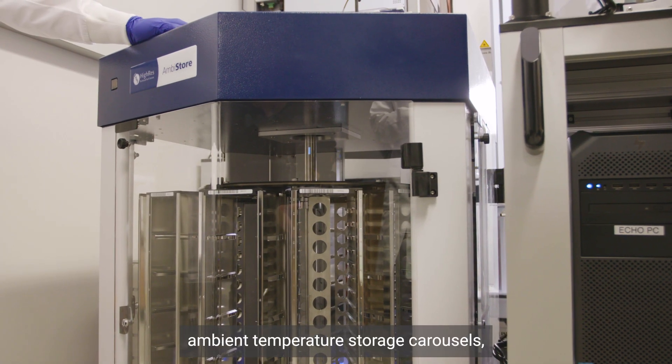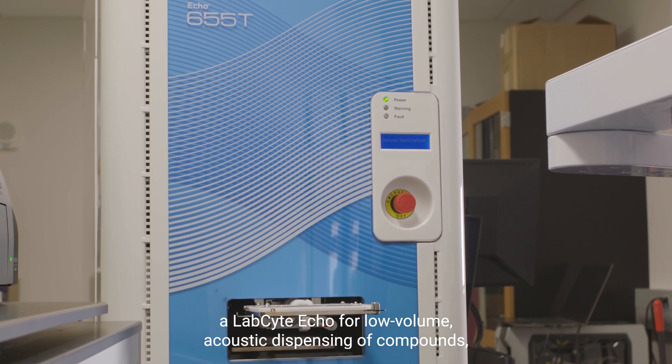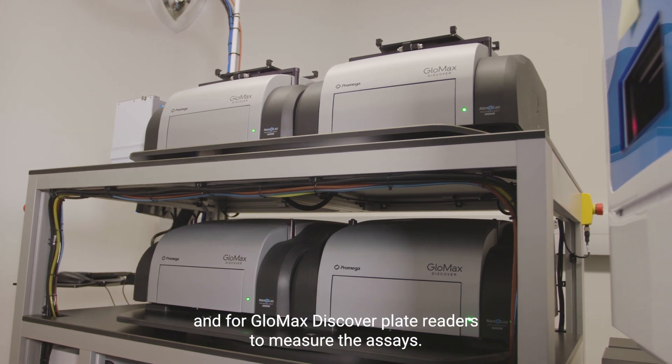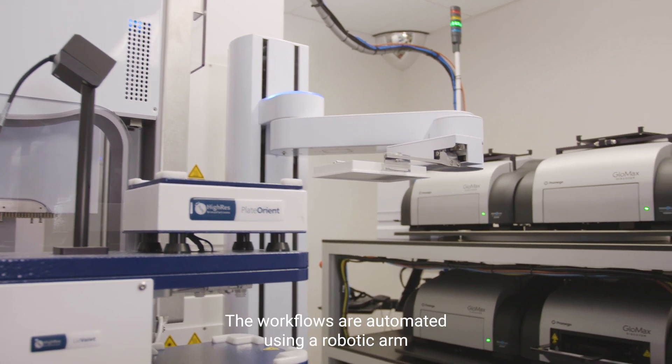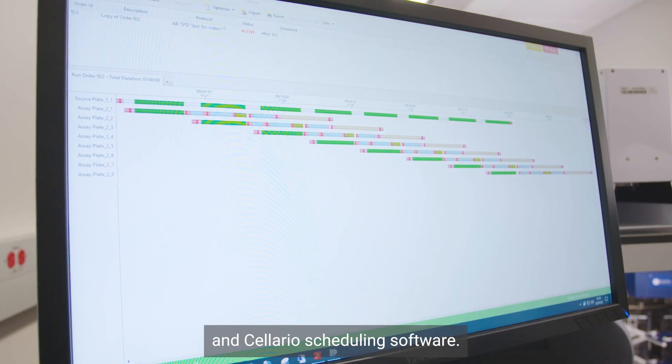Ambient temperature storage carousels, a Labcyte Echo for low-volume acoustic dispensing of compounds, and four GloMax Discover Plate Readers to measure the assays. The workflows are automated using a robotic arm and Cellario scheduling software.